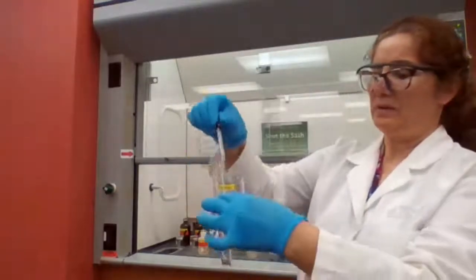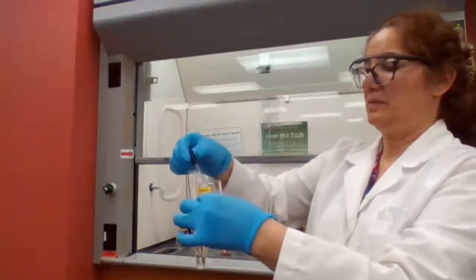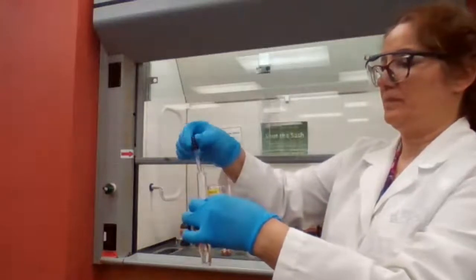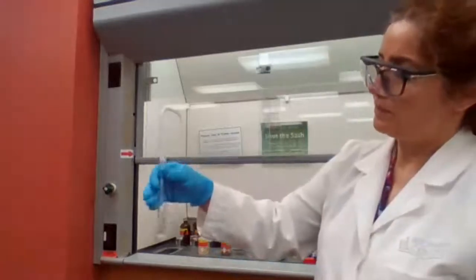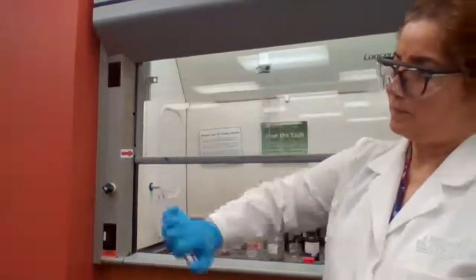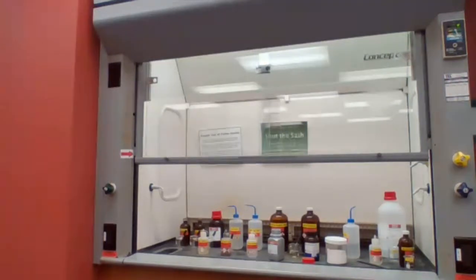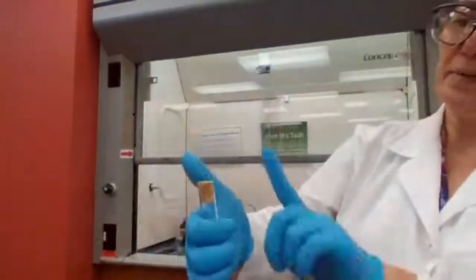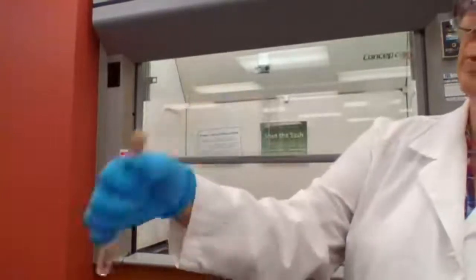Going to add the ethanol to dissolve. Stopper with the cork, mix it well, until it's dissolved and I get a clear solution.